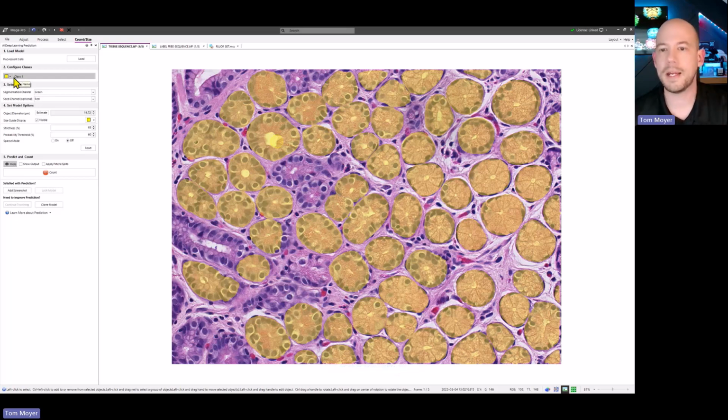So before we clone these models and give them some additional training, if you're just utilizing AI deep learning, but you don't have the ability to do any sort of fine tuning or additional training, at this point in time, it would be a manual process of adding manual labels, deleting things that it's found incorrectly. So having the ability to fine tune and train models, but still utilizing pre-trained to shorten the process and not having to start from scratch is highly beneficial.